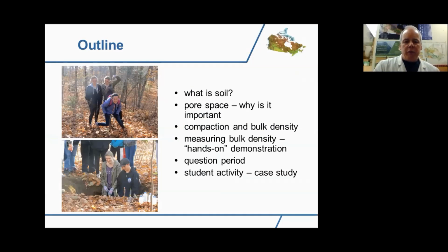So just a bit of an overview of what we're going to talk about today and an outline of the presentation and the webinar. We're going to talk a little bit about what is soil. Hopefully that's review for some of you that have been involved in Envirothon for a while. Then we're going to focus on pore space today, why it's important, talk about compaction and bulk density measurements and define bulk density and how we measure it. Then a short hands-on demonstration as to how we'll do that, and we'll use materials that I have in the laboratory here to do that.